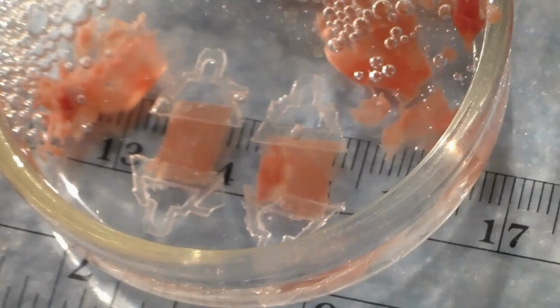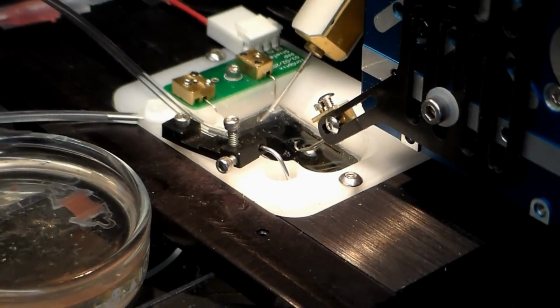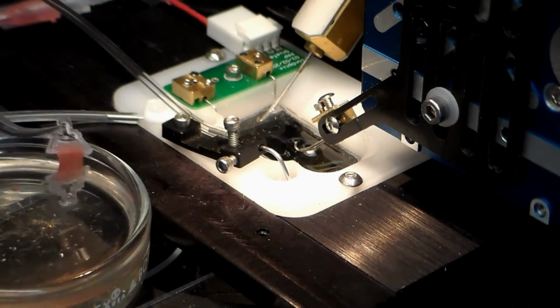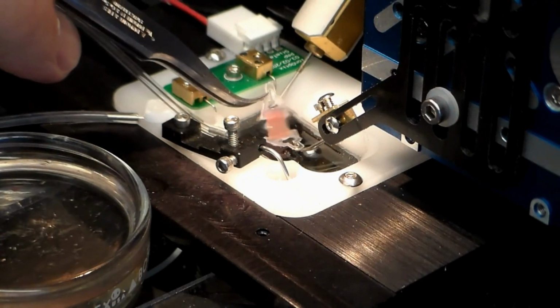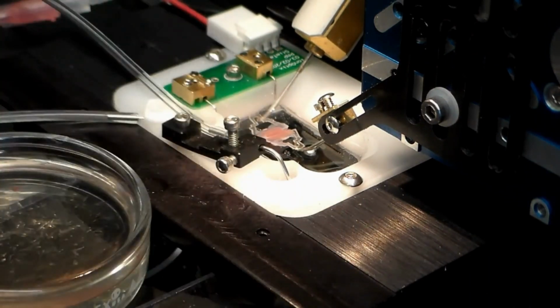So now, with the slices having been created, we're going to load them into the apparatus. You can see the slice now over on the left-hand side of this image. And we're going to pick up the slice and gently lay it into the apparatus, where the clip is going over one hook and then the other hook. And if necessary, we'll have to adjust or finely place the clip over the hooks.